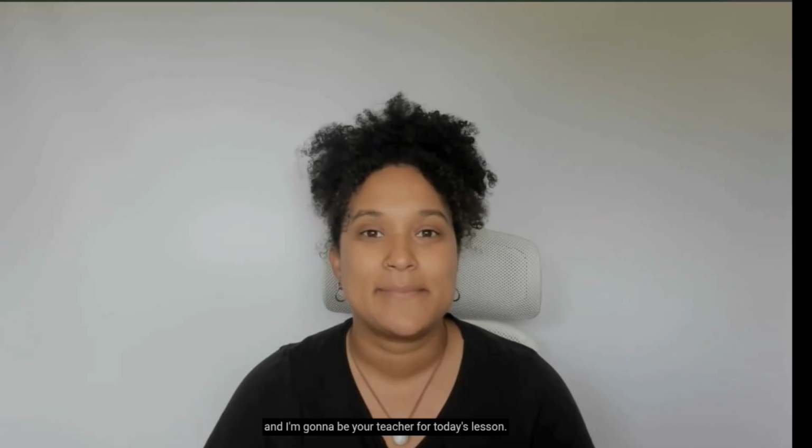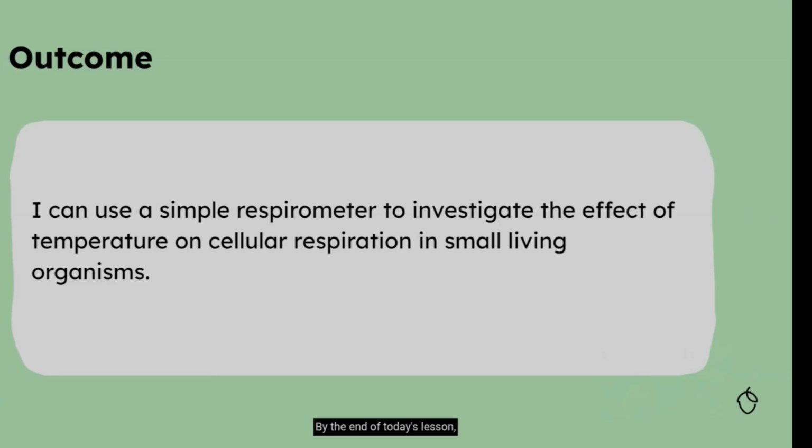Hiya, I'm Mrs. Wheat, and I'm going to be your teacher for today's lesson. By the end of today's lesson, you'll be able to use a simple respirometer to investigate the effect of temperature on cellular respiration in small living organisms.